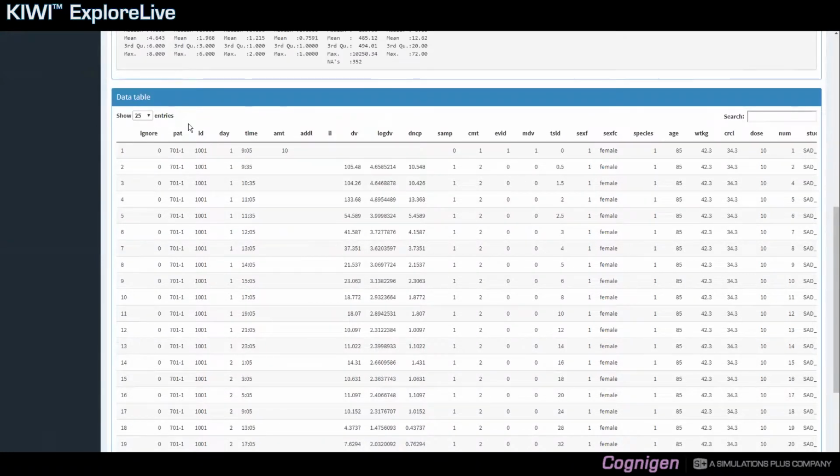This panel provides various functionalities to increase the number of entries that you see by default, and it also provides a search field. It's a very basic search field. It will try to find fields that literally match your text, and it's going to put some wildcard around what you type.